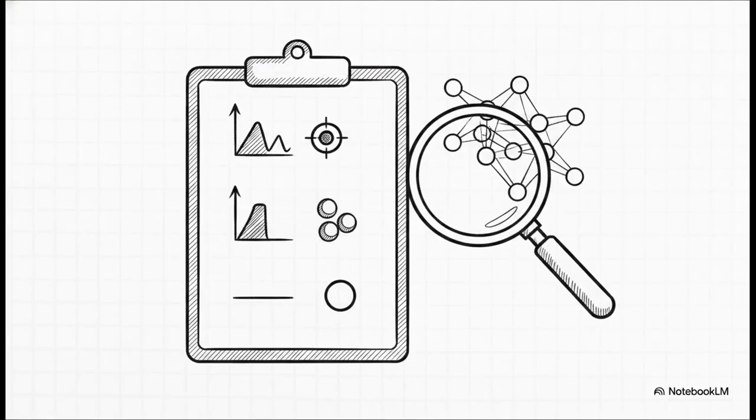So, let's round up the key takeaways from this detective work. A negative peak is your target, the one you zapped. Positive peaks are the physical neighbors within that 4 angstrom radius. A flat baseline means absolutely no spatial interaction happened. Following these rules gives us a foolproof way to map a molecule's stereochemistry. No more guessing based on overlapping standard signals. If you're wrestling with tricky E and Z alkene isomers, NOE difference spectra give you the absolute, undeniable spatial evidence you need to solve the structure.